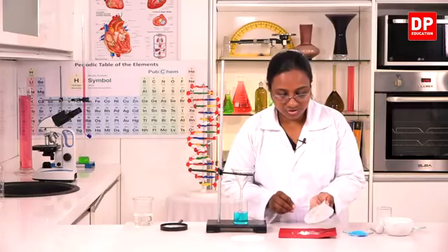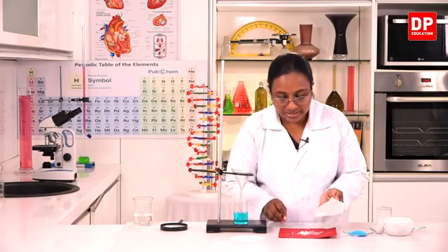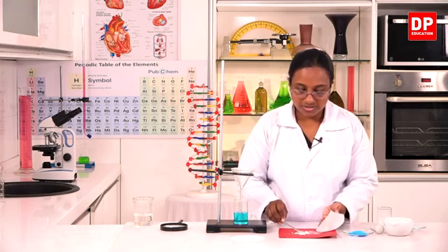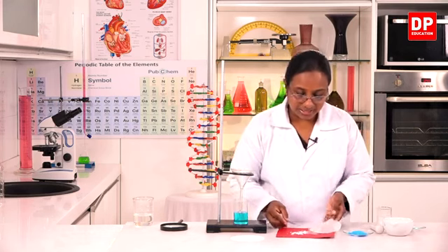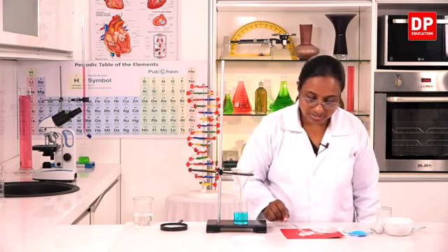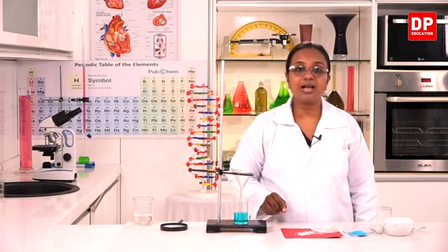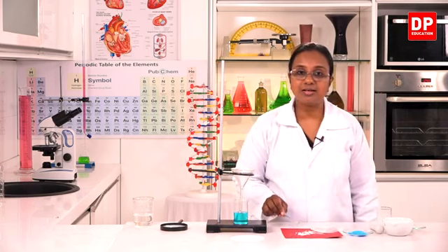Remember, students, this is only for observation. We are not going to weigh the amount of substance. Otherwise, we will have to dry it completely and get all the solid here. Now here you can see this is only the white color solid. That means this is only naphthalene.